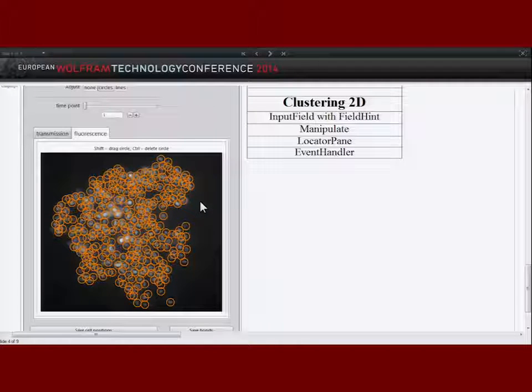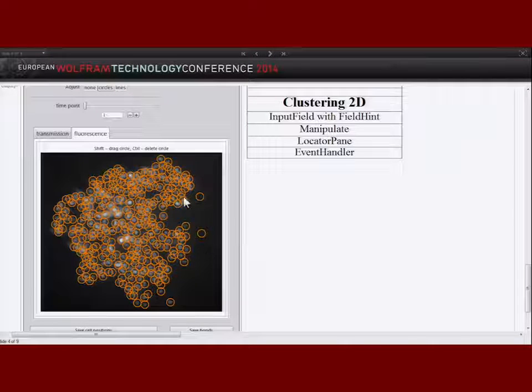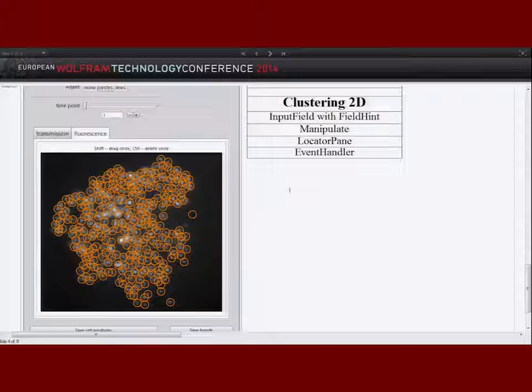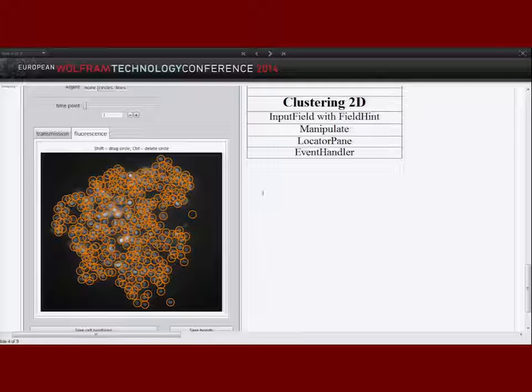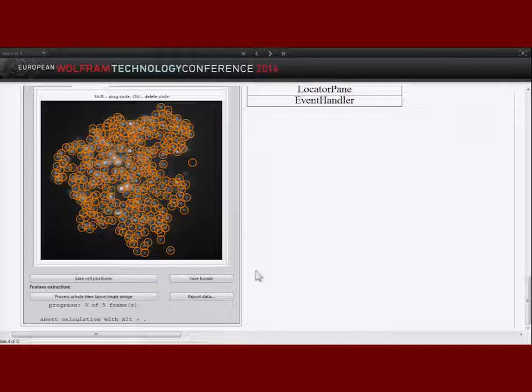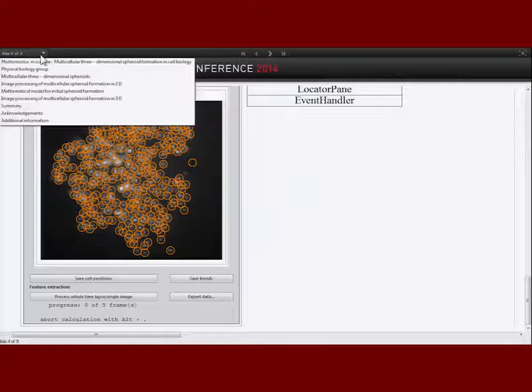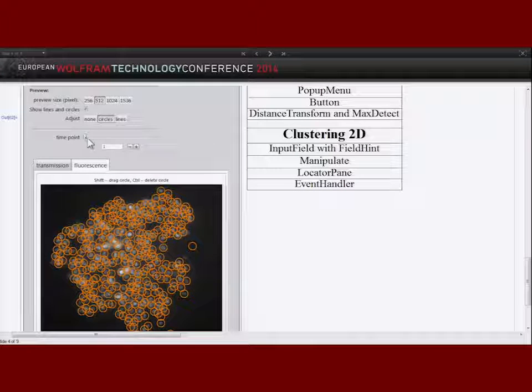The nice thing here is that we can manually correct the segmentation result. We can add, remove, or shift circles. If there's a cell nucleus I can click to add it, or remove it if it's dirt or wrongly detected, or shift it somewhere else. This is done with the EventHandler function, which specifies what happens when I click the mouse or use shortcuts. Changes can be saved, and all information can be exported into an Excel file where all the information is stored.